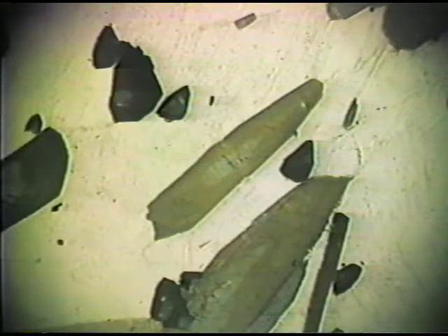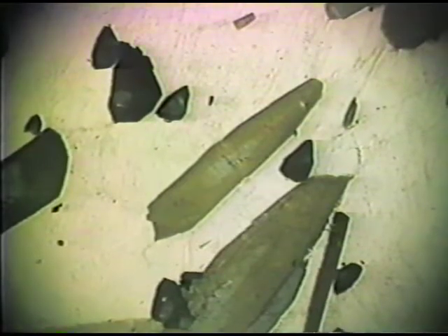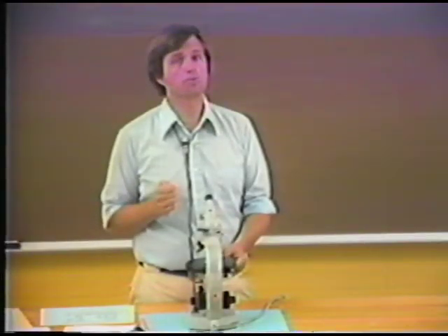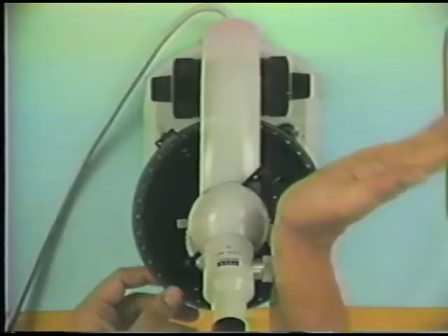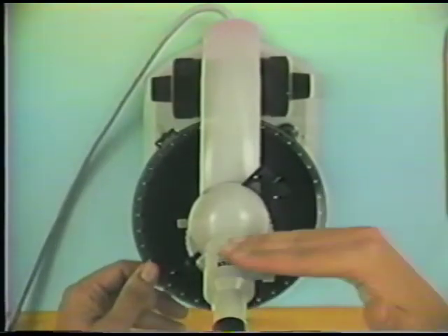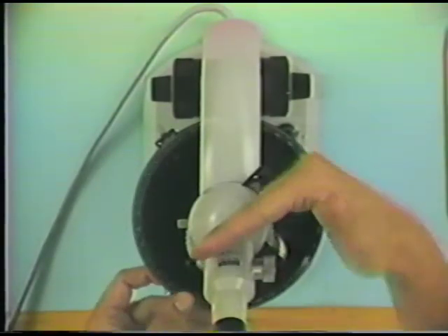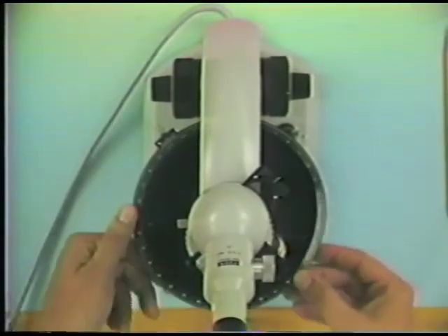Now the procedure then is to rotate the mineral grain until that E ray, which I now know is toward the northeast direction, is exactly in an east-west position, parallel to the microscope polarizer. So I'll now do that. I'll take it from the northeast direction and rotate it until it's exactly parallel to the microscope polarizer. In other words, do this kind of rotation to it. So now I'll do that under the microscope and do this rotation.